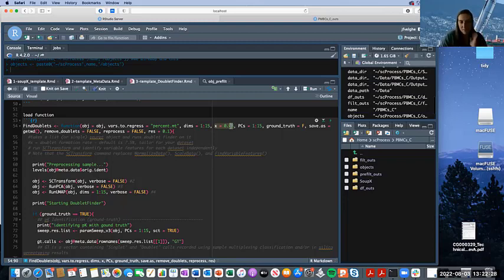So this can be looked up if you're doing your single cell RNA sequencing library prep with 10x. It'll have the table there, and you can basically just run your finger over and say, all right, for about 5,000 cells, it's about 8%.